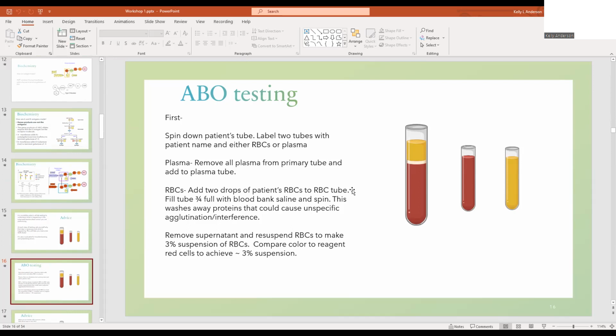The other thing to keep in mind is you have supply shortages all the time, so if you can reuse a transfer pipette, you don't have to throw it away every time you drop something. It's wasteful and there are transfer pipette shortages. If you're using that transfer pipette for the same thing, it's okay to reuse it. You can use one transfer pipette in your class for the whole time.